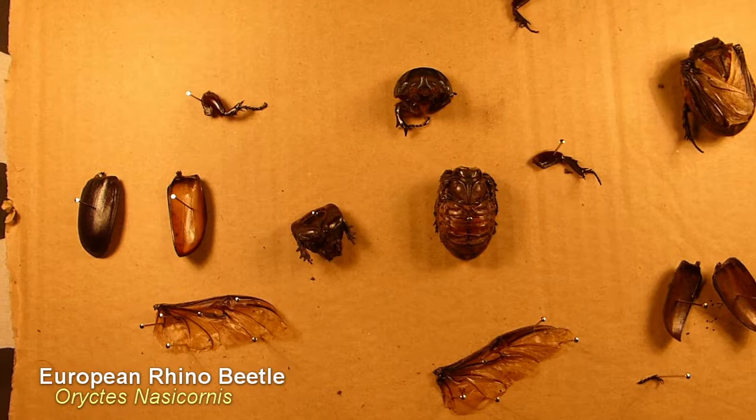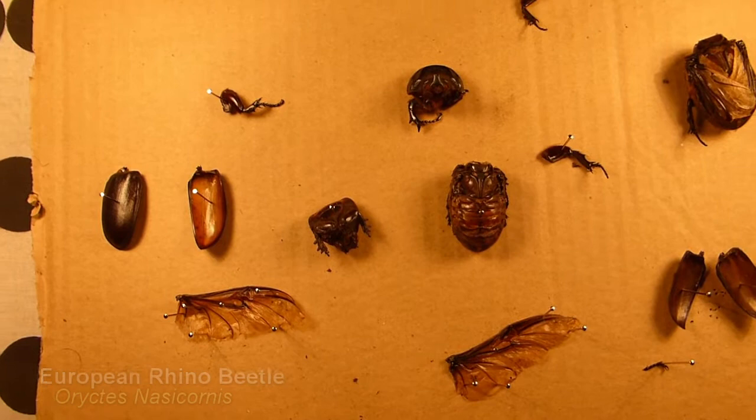Hi there everyone. Today I'm going to be dissecting two members of Oryctes nasicornis, that is the European rhino beetle.